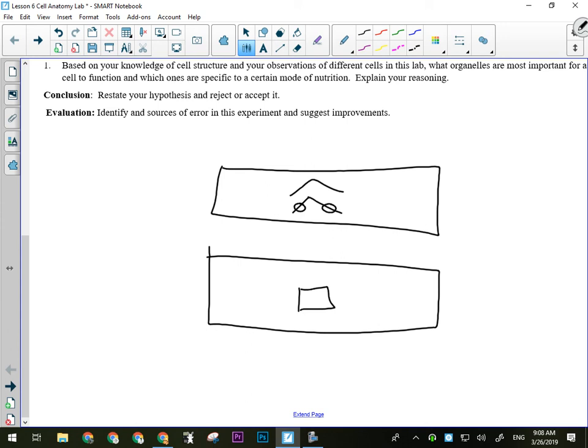Your cells are going to be nearly transparent when you look at this. Anything large, stringy, and dark is food. No matter how well you brushed your teeth or rinsed your mouth this morning, tiny little pieces of food remain. Most of them are fibrous, especially if you have toast or any bread products. So if it's thick and dark, it is not a cell. It is definitely something else.